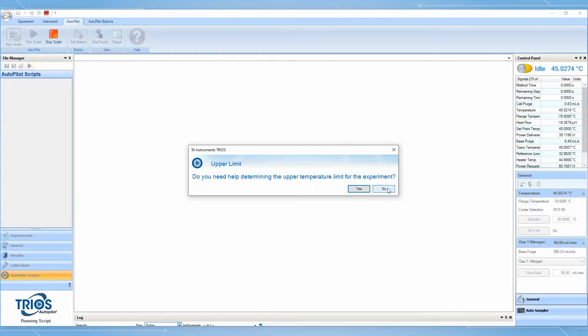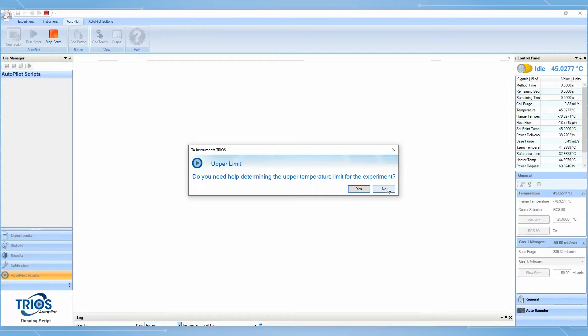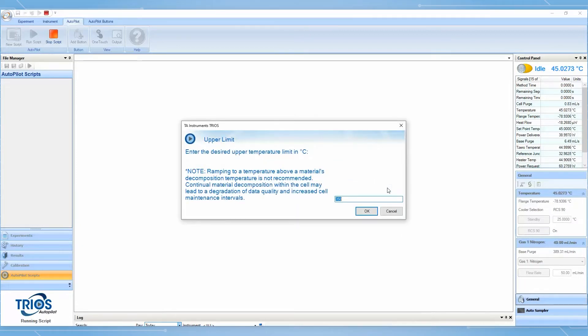The Thermal Transitions Guided Methods leverage visual aids and specific prompts to help reduce mistakes and ensure that samples are loaded correctly.